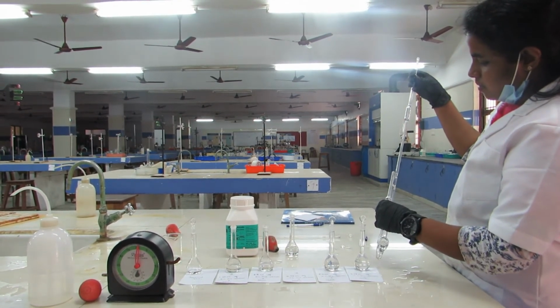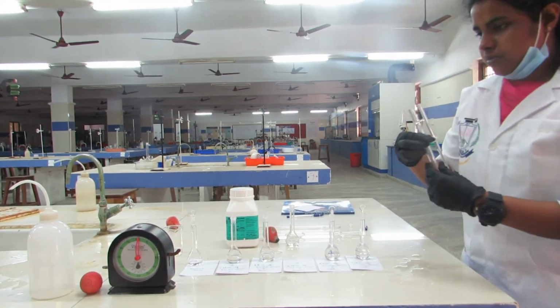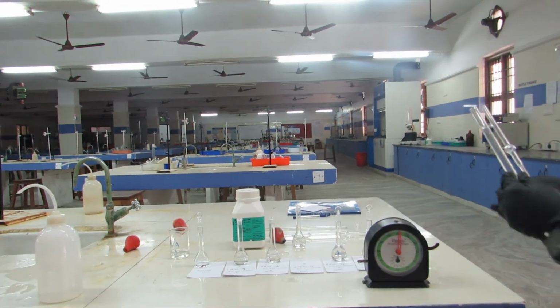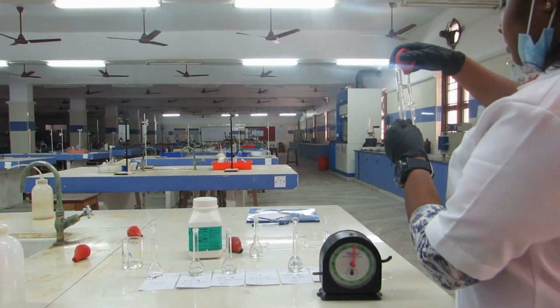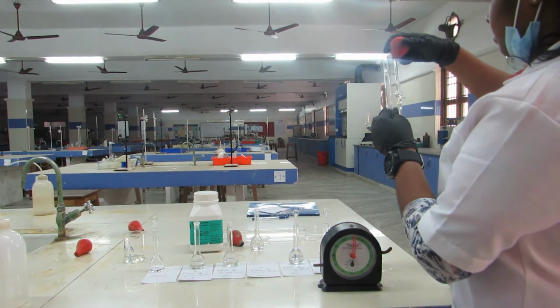Again, you have to take a rubber bulb and on the right side you have to suck the PVA solution. Yes.